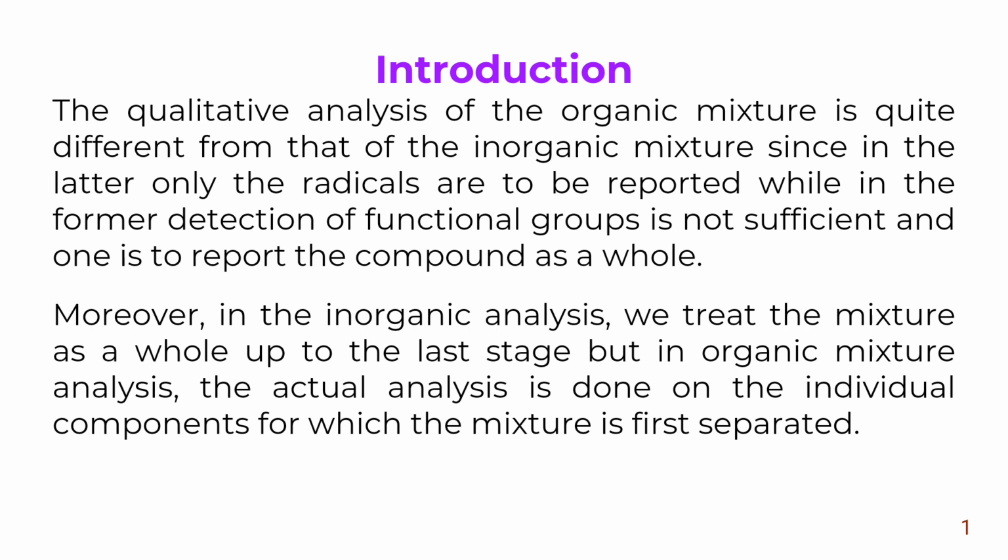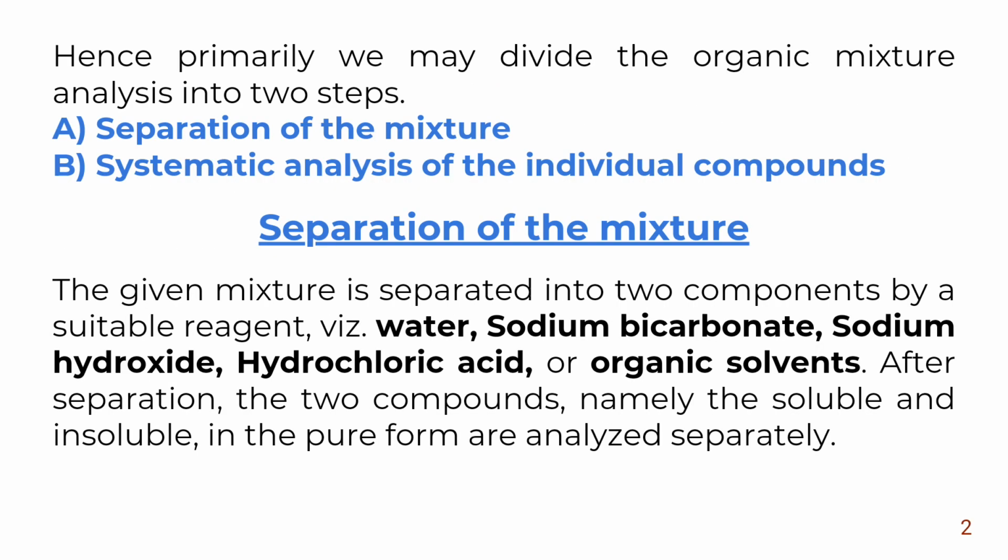Moreover, in the inorganic analysis, we treat the mixture as a whole up to the last stage, but in organic mixture analysis, the actual analysis is done on the individual components for which the mixture is first separated. Hence, primarily we may divide the organic mixture analysis into two steps. Separation of the mixture. Systematic analysis of the individual compounds.